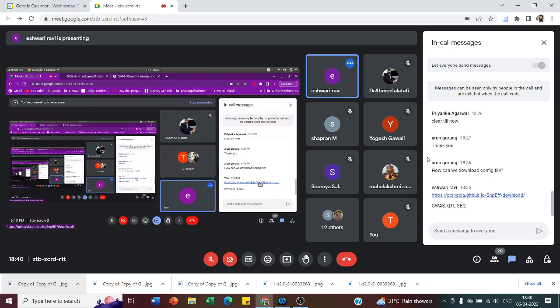I will once again share the workflow for whole exome sequencing data analysis. You can take any raw data. You can download FASTA files, FASTQ files, or if you have any raw FASTQ files, please share among yourselves.